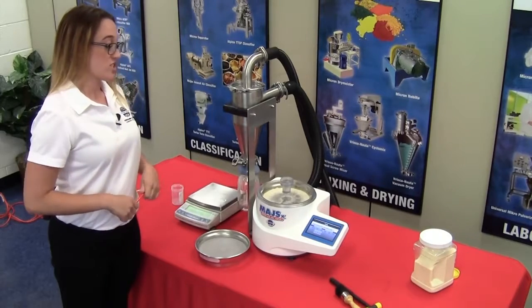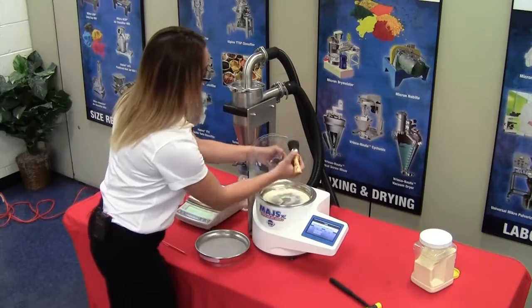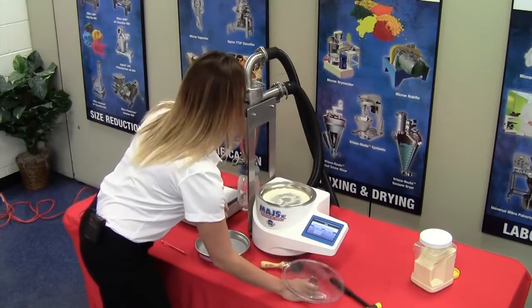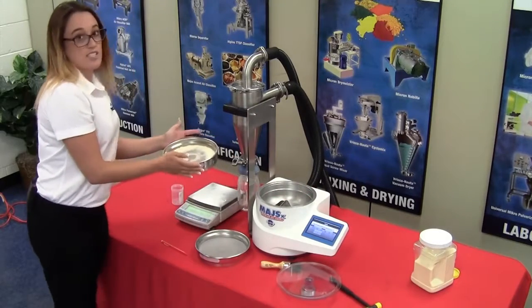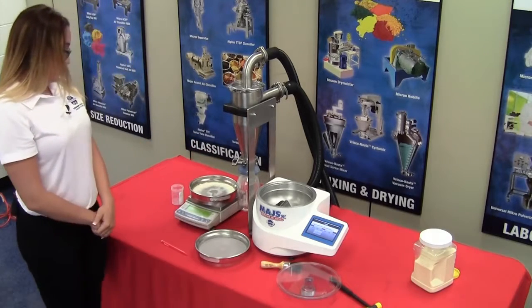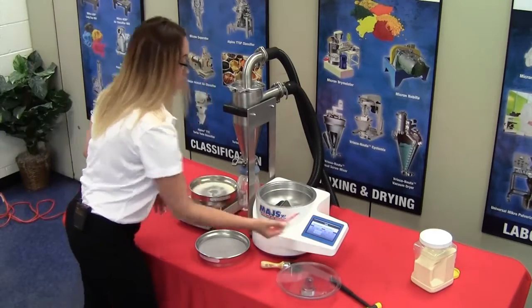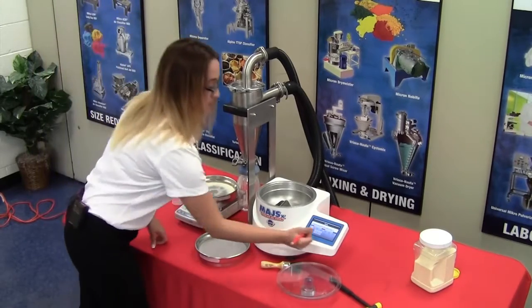Place the 45 micron screen with the sample on the scale. So we're going to remove the lid, and we're going to dust off any extra material we might have gotten due to static charge on the lid. Place the sieve with the sample, because we are testing for retained, onto the scale. Again, the scale is communicating with the airjet sieve. Once the number registers in this little cell and it matches the one on the scale, we can press next.